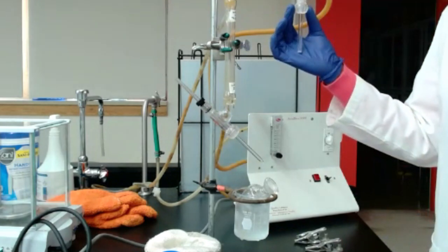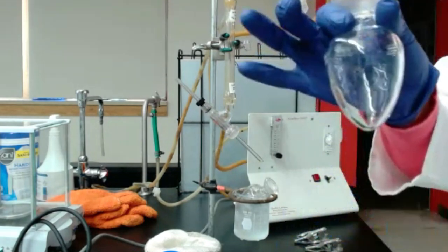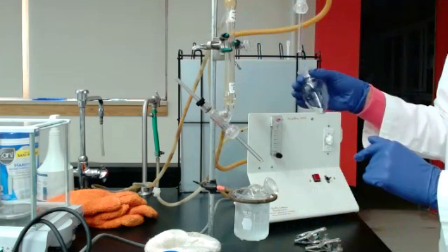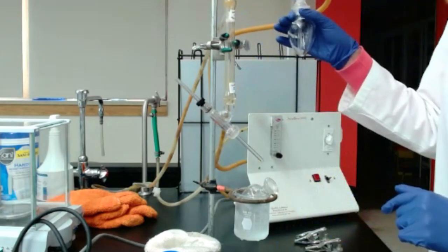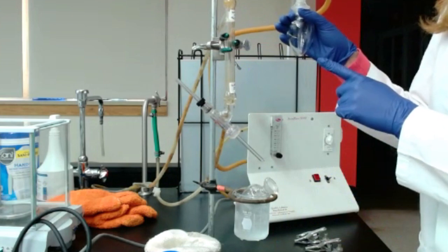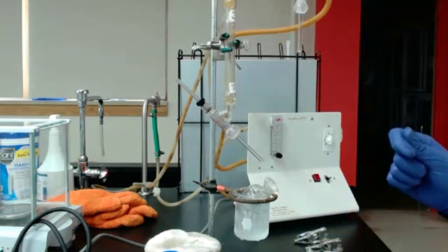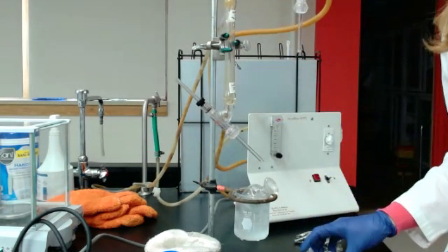So at the bottom of this, you're going to have that flask D. So D flask, exactly the same as the other one. That will be fixed here. And that's where you will have hydrogen peroxide with a little bit of sodium hydroxide, but mainly hydrogen peroxide.